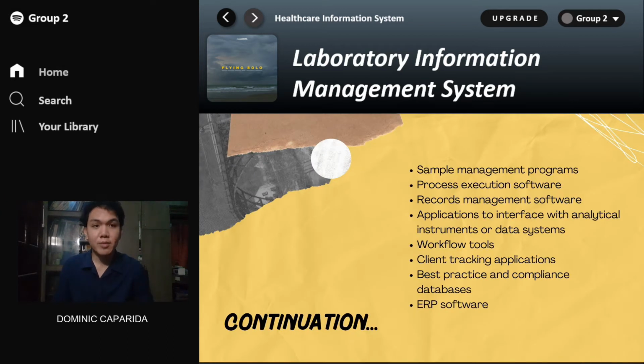Next is sample management programs. These sample management programs ensure the data security and accuracy of all samples right from when they are received in the lab until they are processed, tested, and shipped out. These sample management programs are focused on the samples. They manage the samples as soon as they are extracted from the patient. They make sure that it is managed well, it is stored well, and it is still viable.